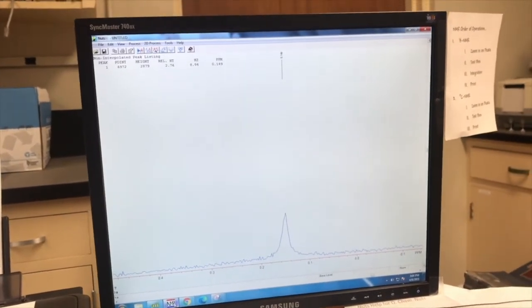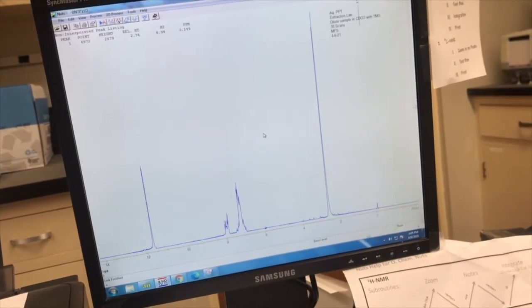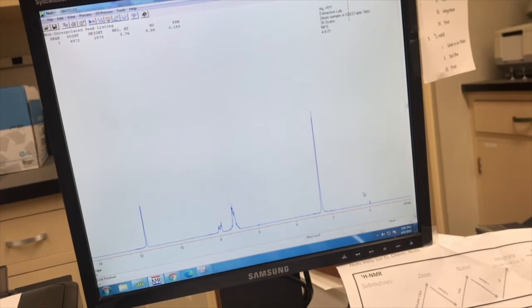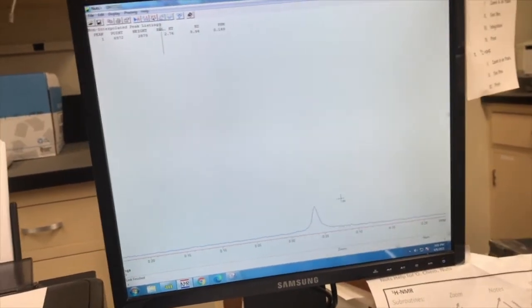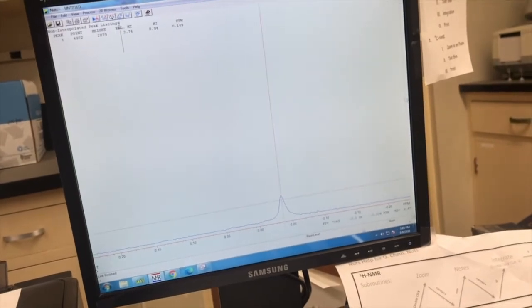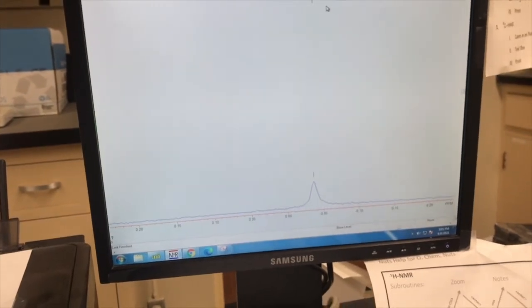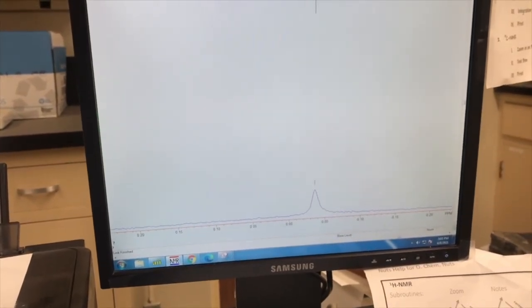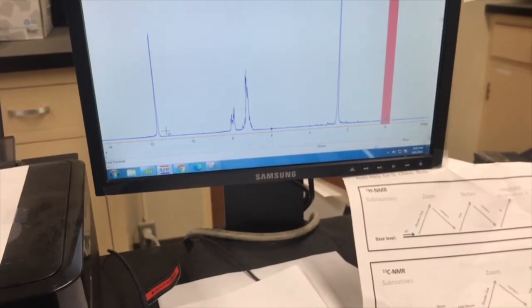And then I type A2. Ooh. Zoomed in a lot. Okay, it's looking pretty good. TMS is, it's not exactly 0. It shifted a bit, huh? It's at negative 0.036. It's close enough, but you know what? I could still fix it. And the rest of this looks good.